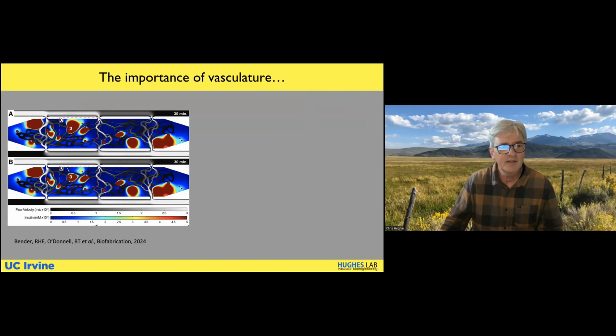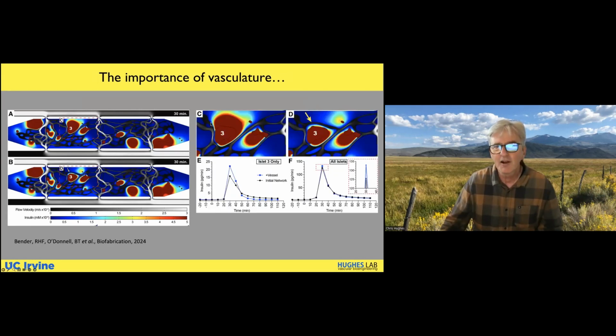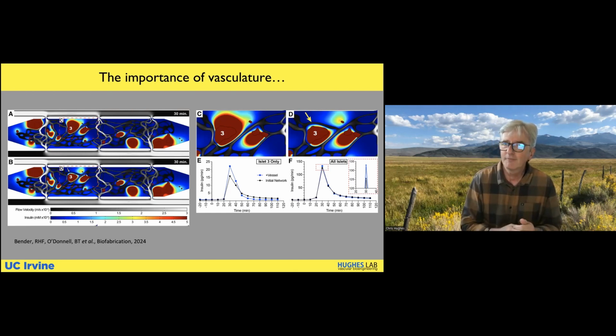So what we did, we engineered in a new vessel. So in C on the right, there's no vessel over the top of islet 3. Just in engineering, we put in a vessel, and then we ran the simulation again. And so in E here, you can see that with this extra vessel there, there's now more insulin production because we're delivering more oxygen and nutrients, and there's therefore more insulin released. And on the right, if we take the aggregate of all of these islets, you can see in that little inset there that it makes a difference to how much insulin is produced by the entire system, because more of it is being captured in this one extra vessel over the top of islet 3. So that just shows you why it's important to have vasculature in our platform. It also shows you how important it is in the body to have vessels very closely around the islets.